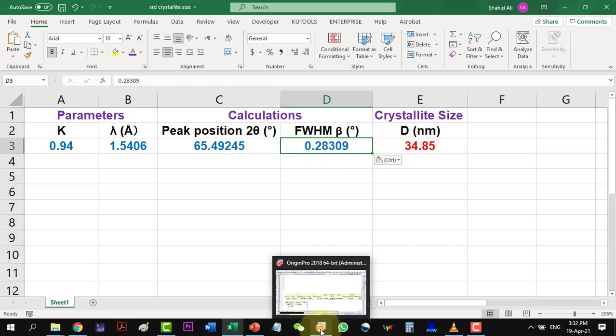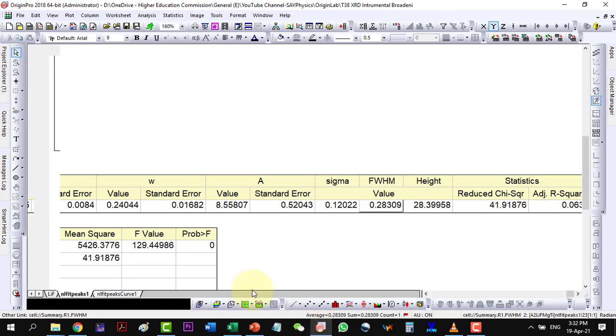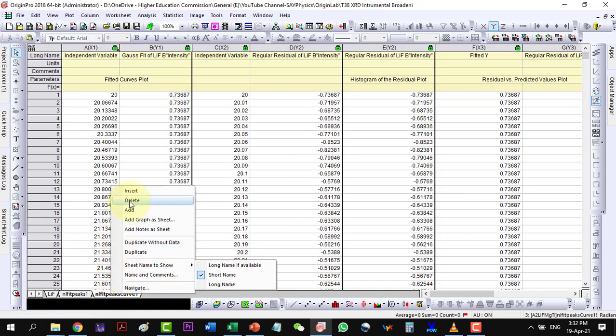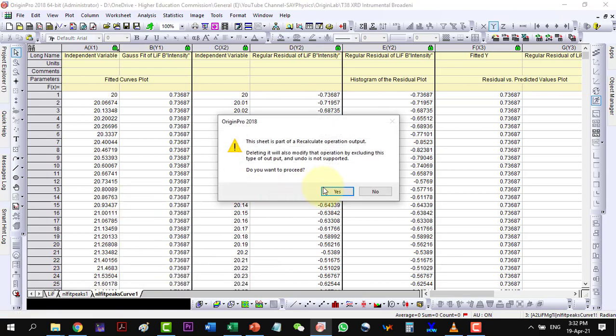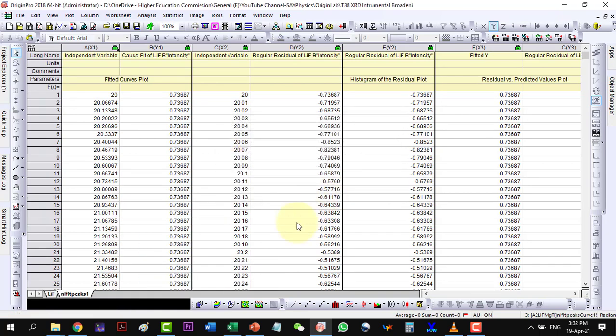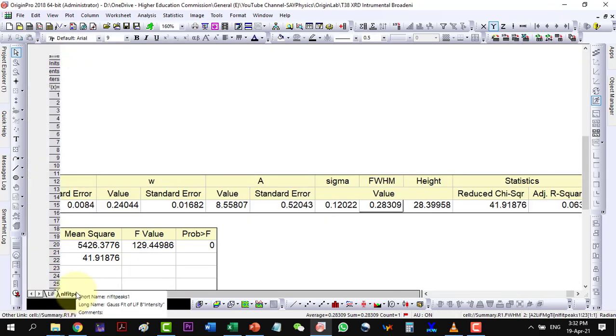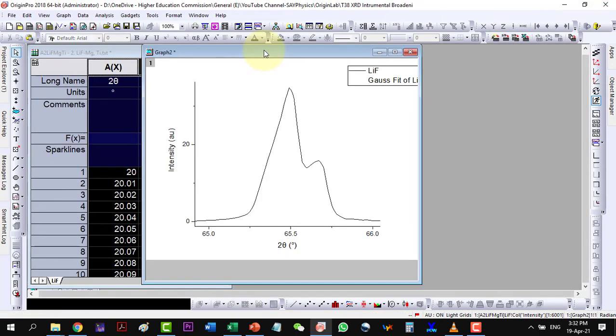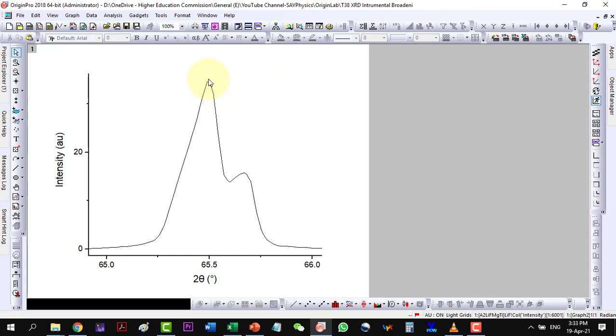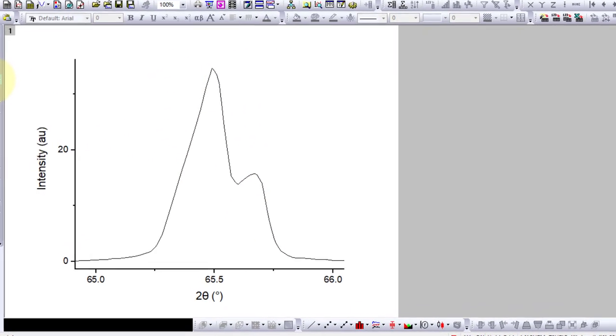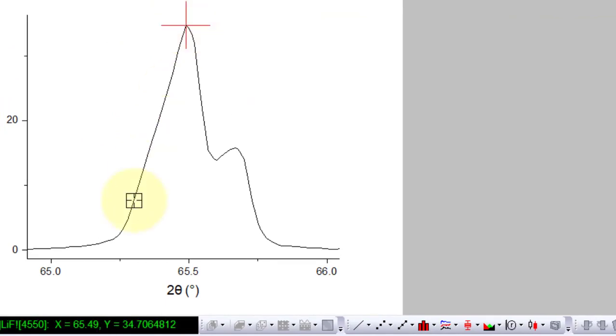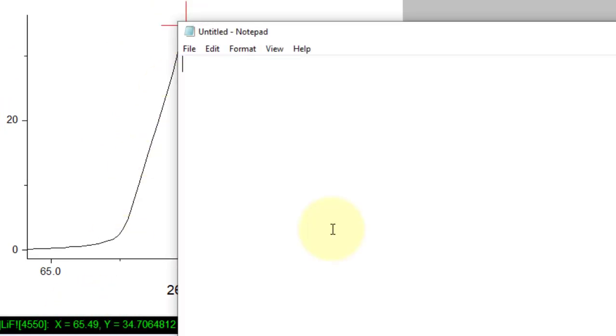Now, let me delete this data and start with the deconvolution of the same composite peak. Here, I will have to note the positions of these two peaks. As in fitting parameters, I will need these positions.